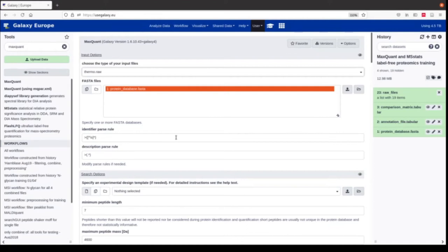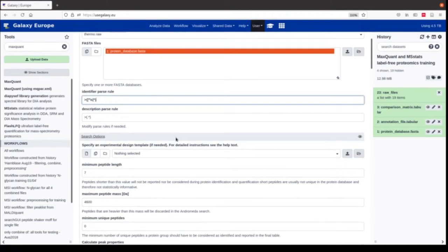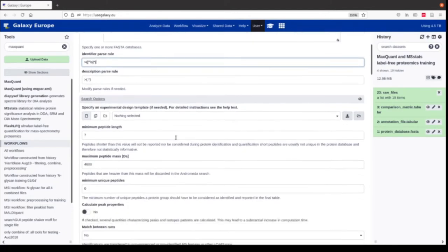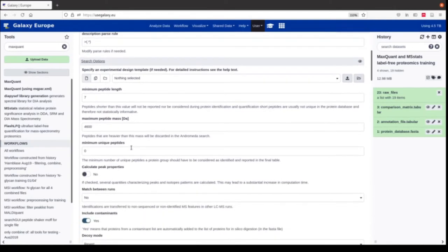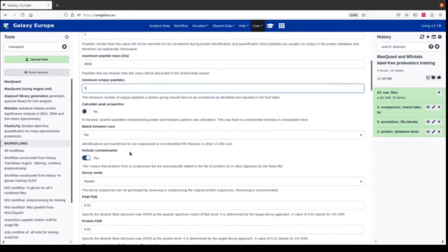The FASTA parse rules specify which part of the protein headers are kept and how they are split to appear in our output files. MaxQuant does identification and quantification, so here we have many parameters for the search options. We set the minimum unique peptides to one, meaning we are only interested in proteins that have at least one unique peptide — a peptide that only belongs to this protein and is not shared with other proteins. Then we set match between runs to yes.